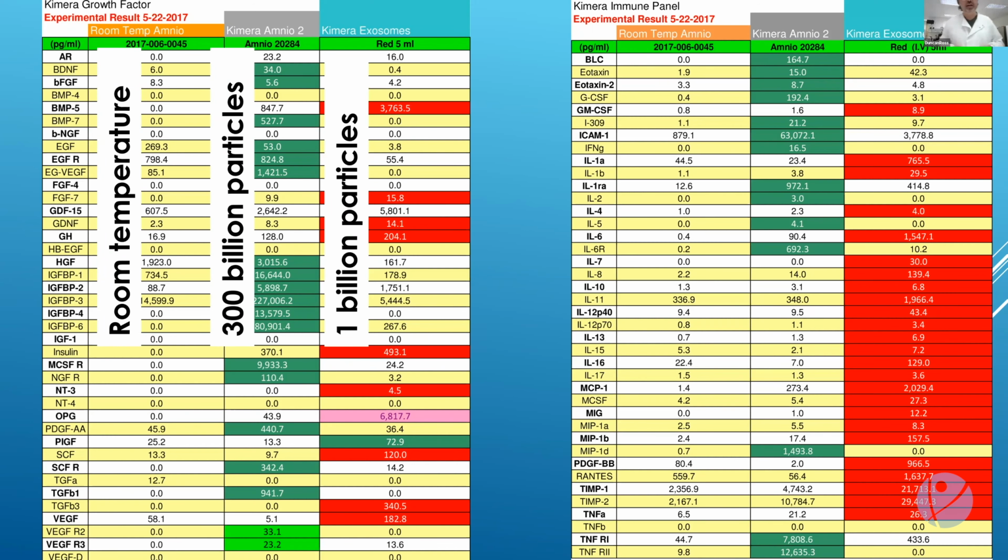So we did this growth factor assay looking at the proteins, and I did this for myself, not for you. I wanted to see what the difference between my amniotic fluid and my mesenchymal stem cell exosome fluid was. I might have thought that they would look the same. If mesenchymal stem cells were really what was creating the exosomes in amniotic fluid, they would be the same. When I saw this, I immediately realized they're not the same. If you look at the amniotic fluid, the profile looks like a fibroblast profile. In fact, it also looks like a PRP profile. So the interesting part of this is that it looks like an anti-inflammatory PRP. And in our hands, it seems to function that way.